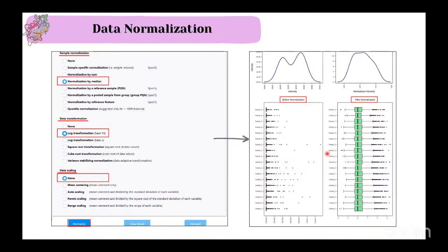The multivariate analysis starts with the normalization. Normalization is generally to reduce the experimental variations caused by reproducibility, which occurs every 6 months. For example, if you are planning a stability experiment where your clinical samples or biomarkers are run in the 1st month, third month, fourth month, and so on for repeated time points, or any experimental deviation, you can select whichever normalization suits.